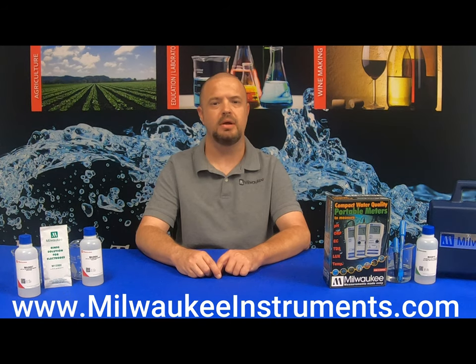When testing pH in meat and cheese applications, be sure to order the Milwaukee Instruments MW102-Food as it includes the MA920B1 probe that is specific for meat and cheese applications. If you already have the standard MW102, you can simply order the MA920B1 pH probe by visiting MilwaukeeInstruments.com.